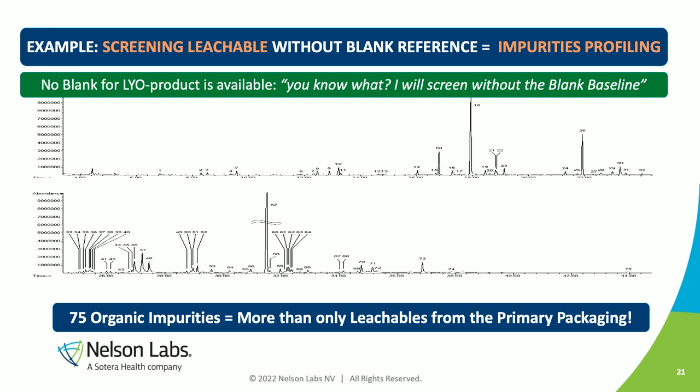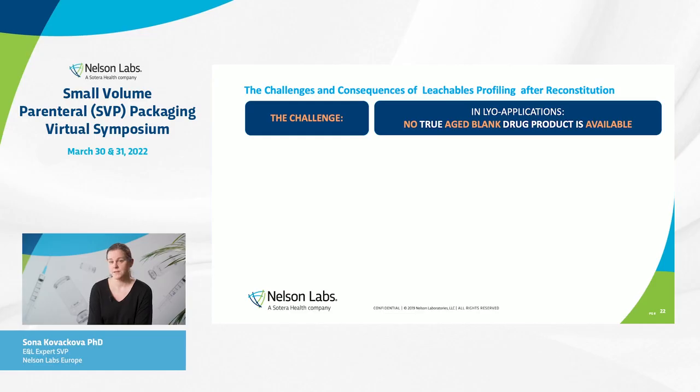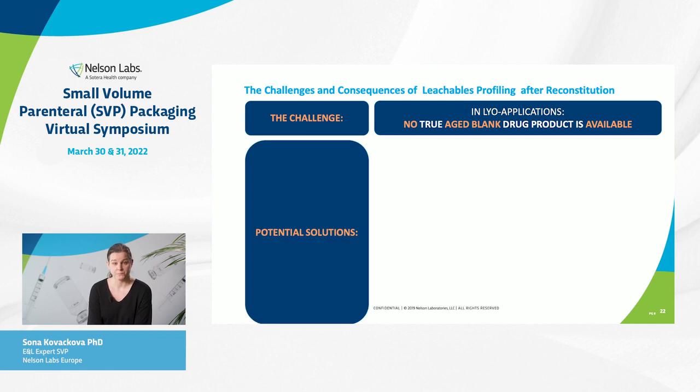But the problem here is that you cannot really distinguish between the leachables and the compounds which might originate from the drug product degradation or from the production process of the drug product. Let's take a look at how we can overcome the challenge of unavailability of the true blank solution.